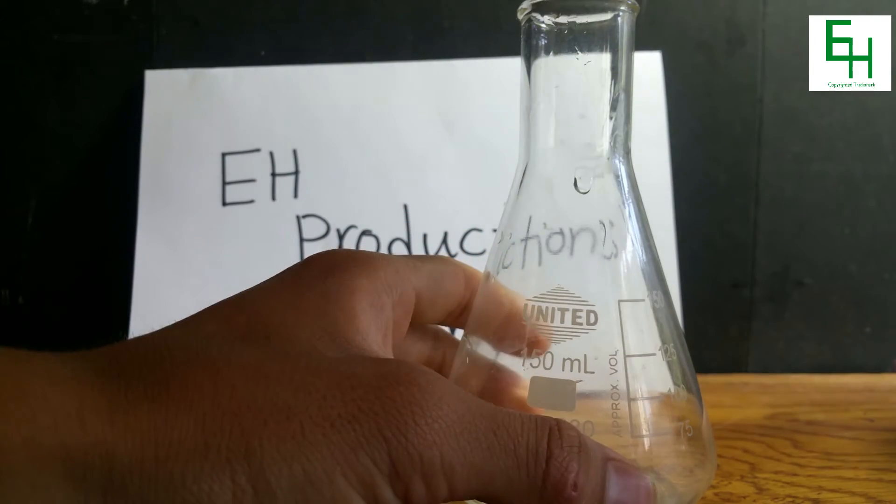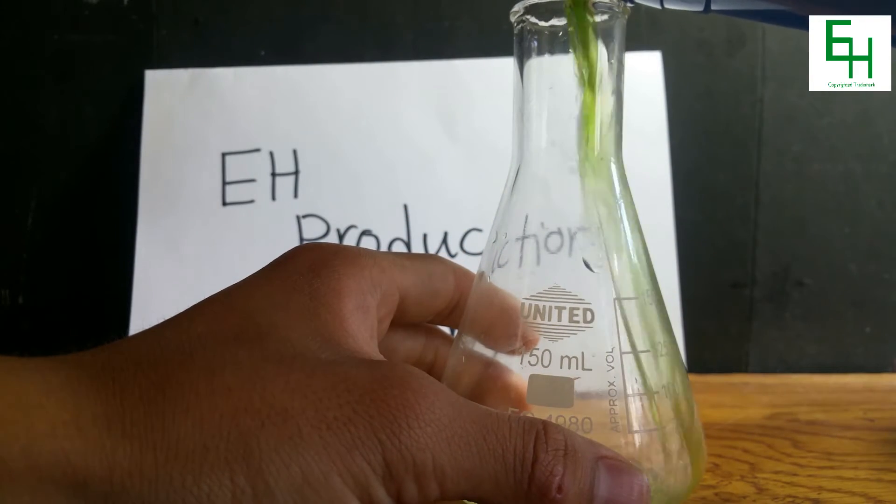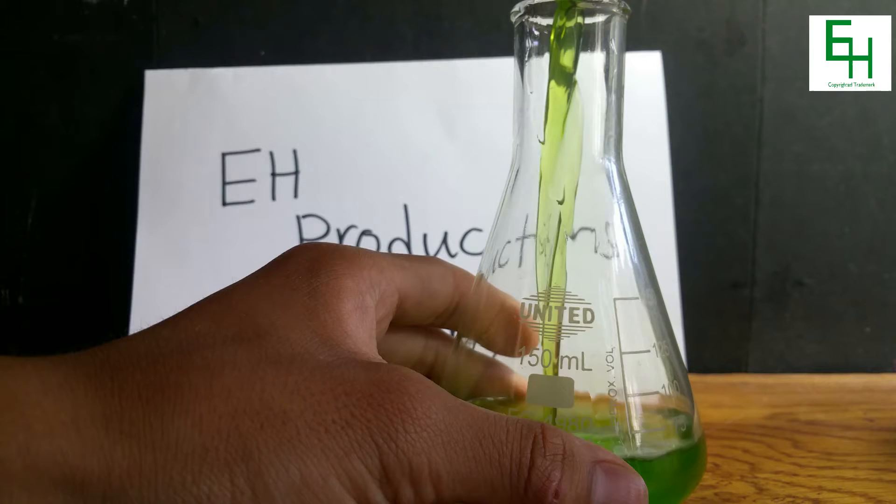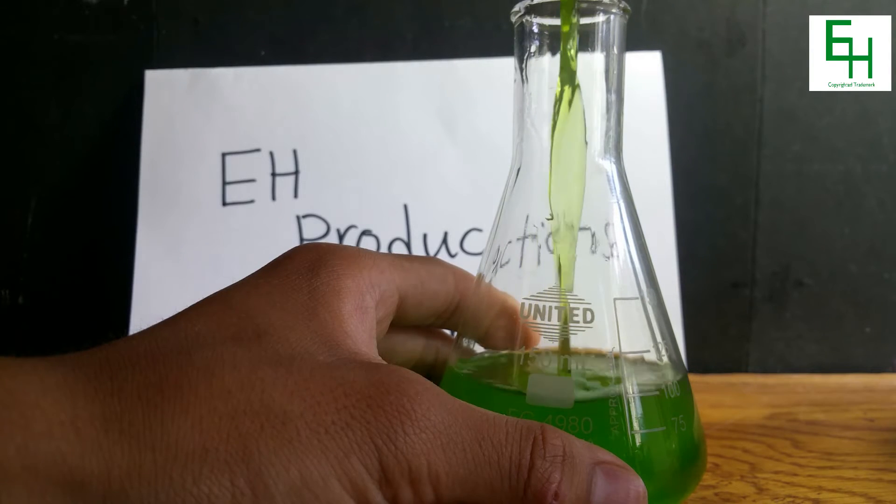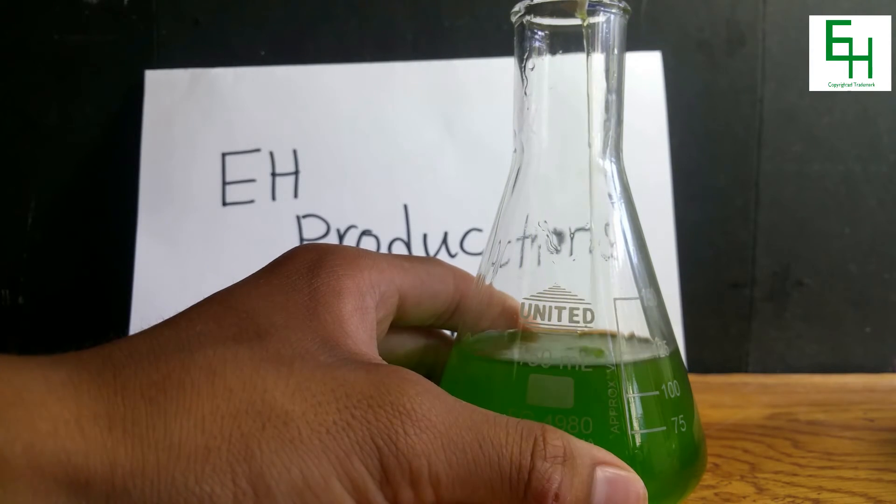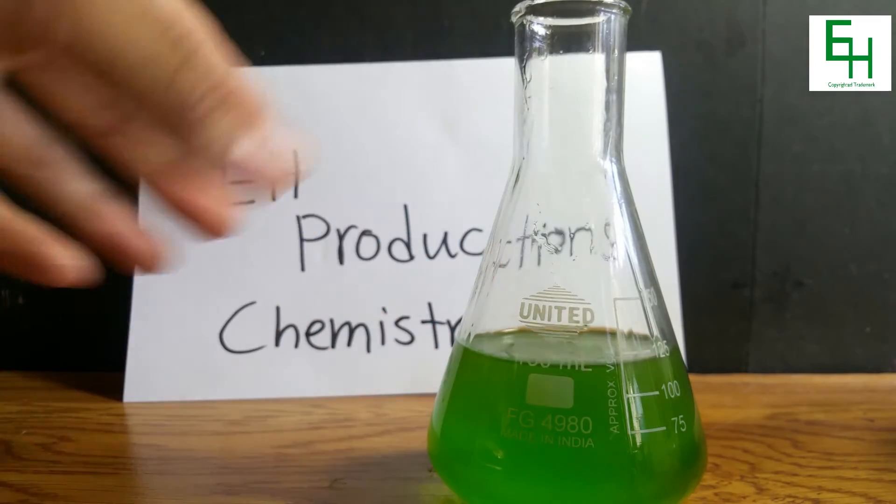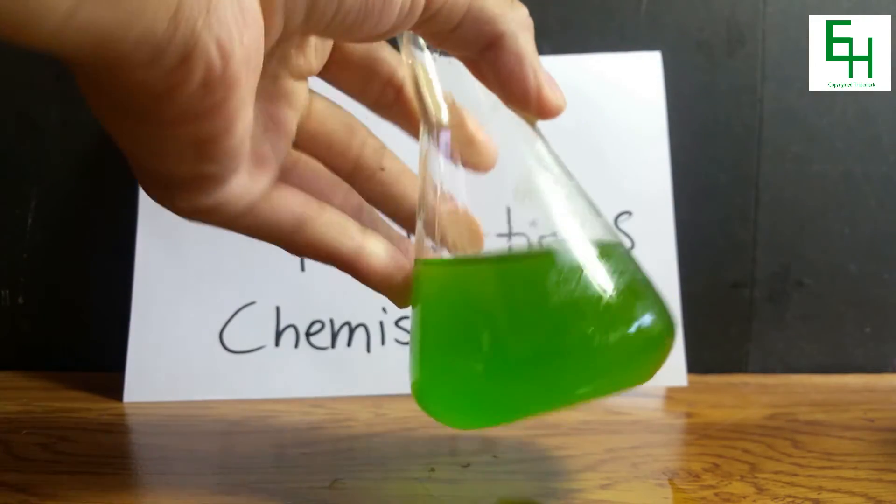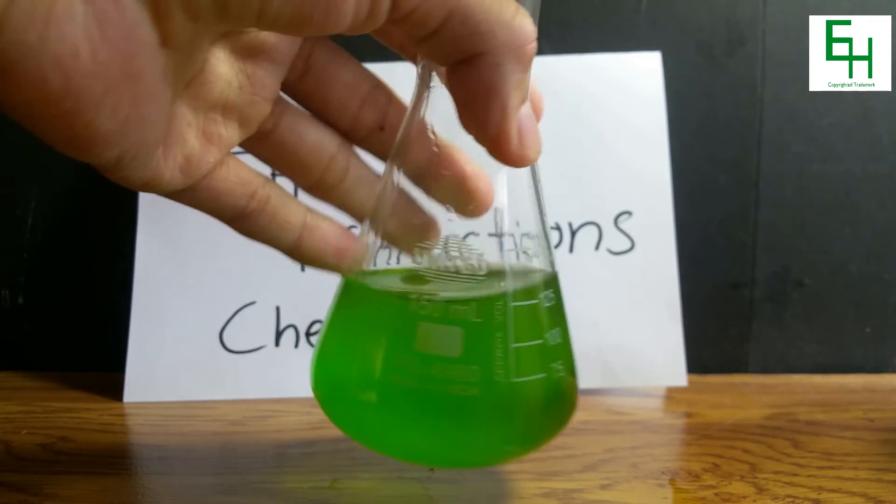Alright, here's my flask. My Erlenmeyer flask to be exact. And we're going to pour this in very carefully. There is our clean chlorophyll mixture. It looks pretty cool.